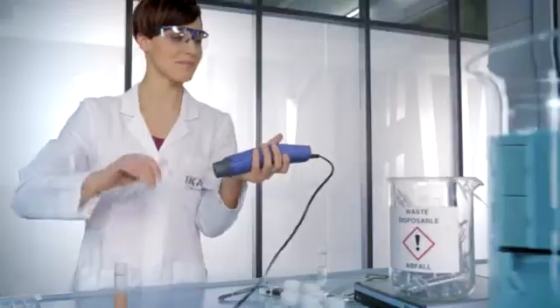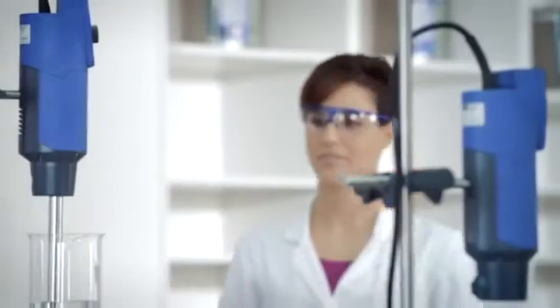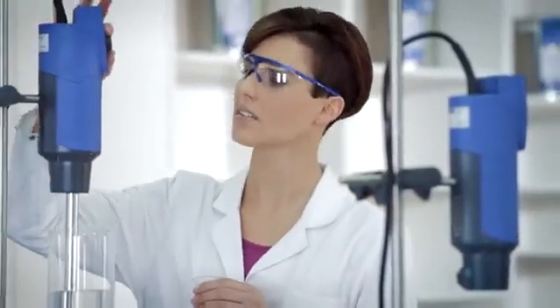IKA Ultra Turrax T18 and T25 digital. The workhorses for everyday routine work.